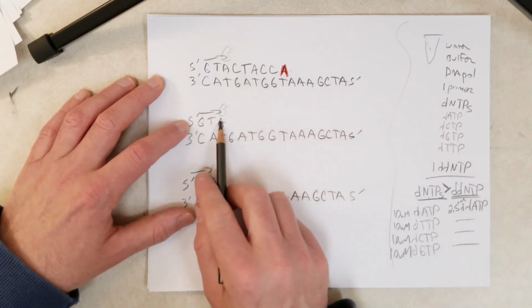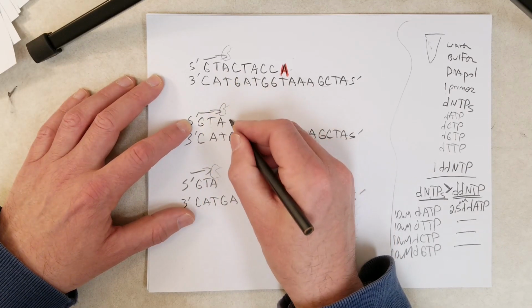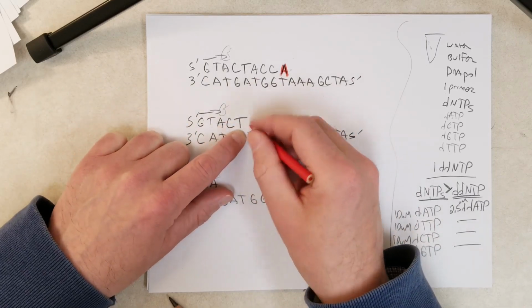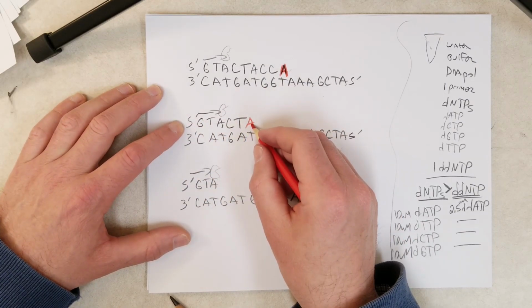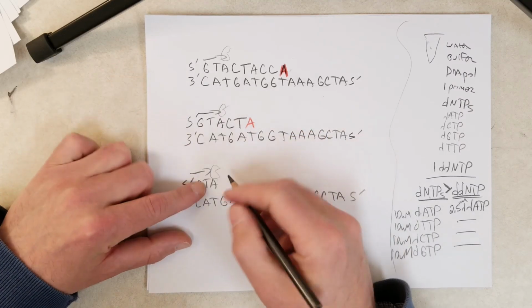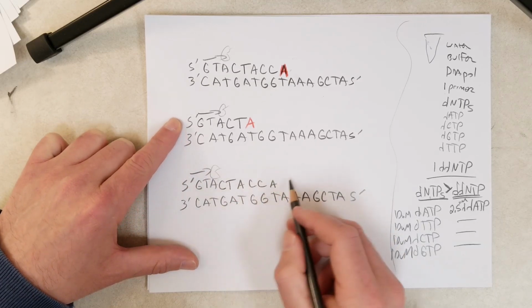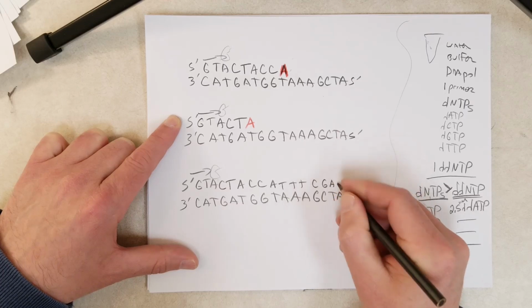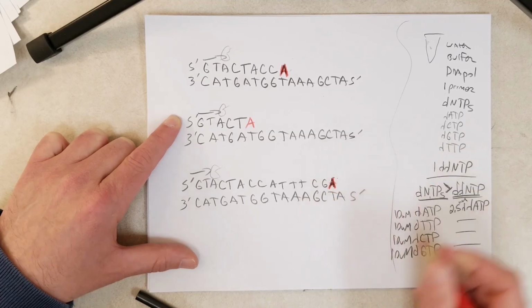Okay, so this one, the polymerase down here is extending this one, and at the same time there was a polymerase working up there. Okay, let's see what happens here. And let's say this time, the very first time, the polymerase inserts an A, inserts the ddATP here. So this chain is terminated very early, right away, when the first A is needed. And let's look down here. Okay, polymerase down here, synthesizing. Let's say, oh, okay, we incorporated 2 normal A's here. Well, okay, say it's this one right here. This A here gets the chain terminator. Okay.